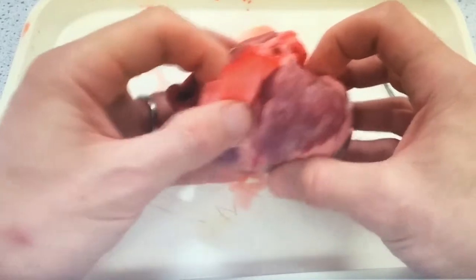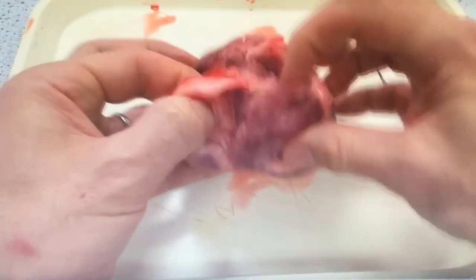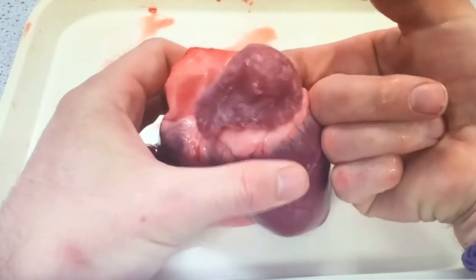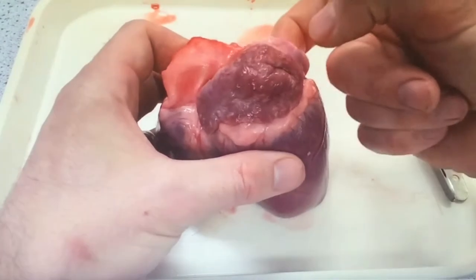Exploring the left side of the heart, if you stick your finger into the hole at the top there into the pulmonary vein, carrying oxygenated blood from the lungs back to the heart, you can see the atria sitting on top of the ventricles and you can feel how thick the muscle wall is there.